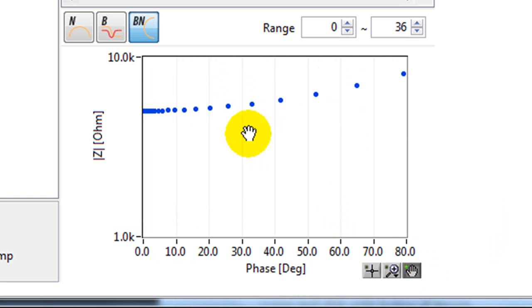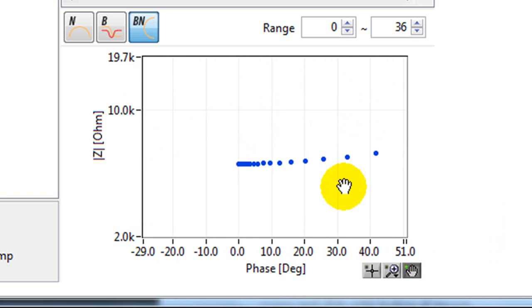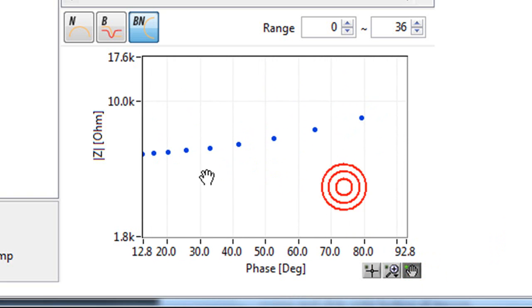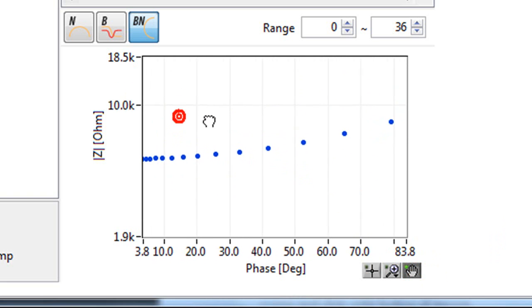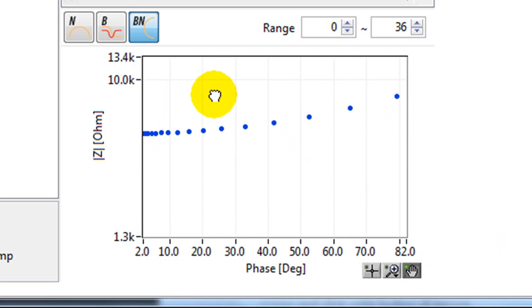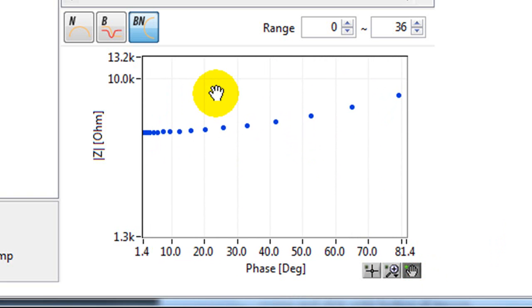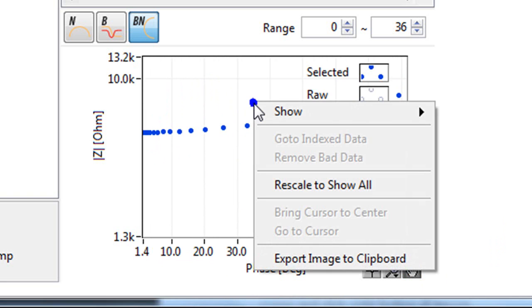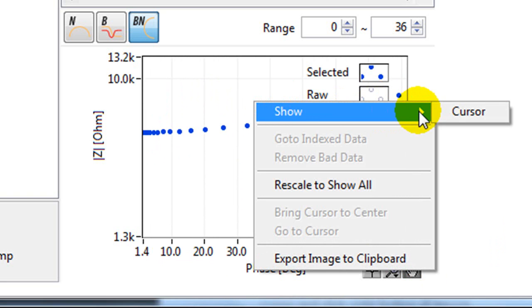If you select the hand, you can move your data around. If you right click, you can show the cursor.